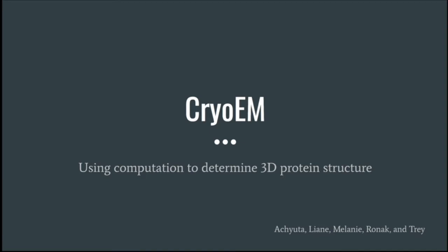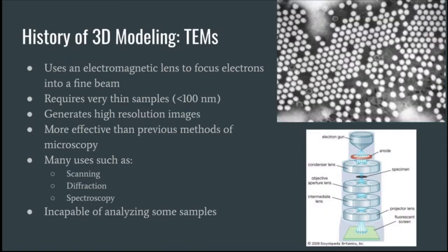Today we'll be talking about a method called CryoEM and how it's used to determine 3D protein structure. So first we'll talk about the history of 3D modeling.